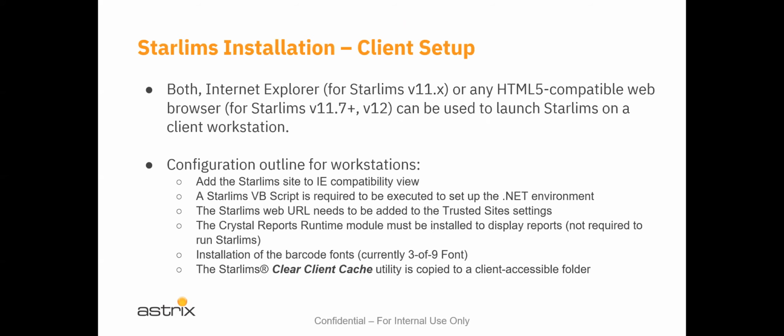So client setup, there's a little bit we need to talk about. You'll encounter Internet Explorer for STARLIMS v11 products, or any HTML5 compatible web browser for v11.7 plus, actually v12. I didn't mention that before, but v11 started to cross the bridge between the XFD technology and the new HTML technology. We're going to talk about something called the bridge in a moment.